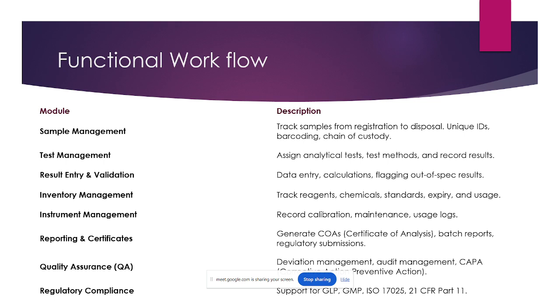And then coming to reporting and certifications. Once the result is entered by the analyst and reported, we can generate the COA. For these COA generations, I told you we need to create Crystal Reports and provide them to the end user. Whatever reports we created, we need to provide to the end user. He will use that report and generate the COAs. For the Crystal Report, we need to create some arguments, and after creating the arguments, we need to map them to the query tag.